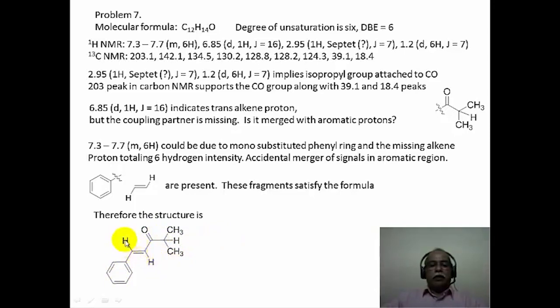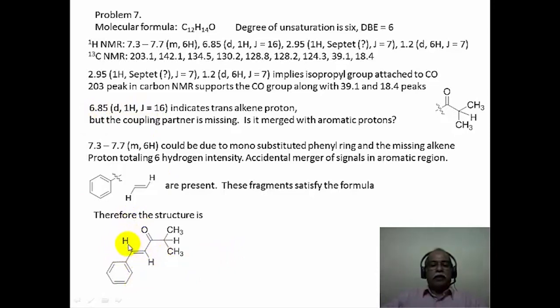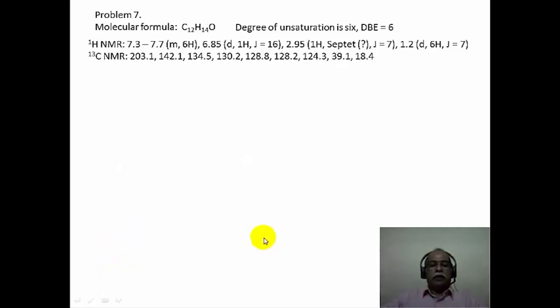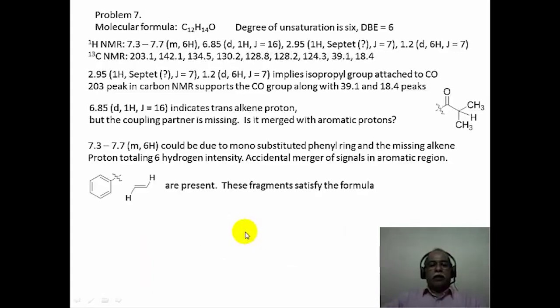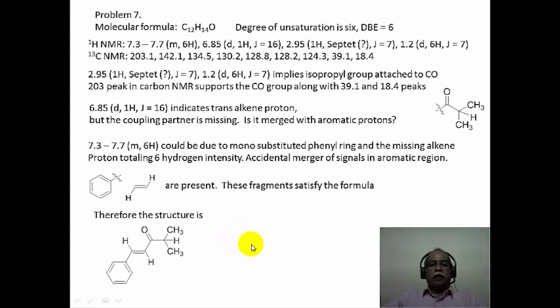Putting all these fragments together, you can arrive at the structure: isopropyl phenyl ethenyl ketone. The trans double bond corresponds to the 16 Hz coupling, and the hydrogen at 6.85 ppm corresponds to the alpha hydrogen of the alpha-beta unsaturated ketone. The beta hydrogen has a higher chemical shift value and merges with the aromatic signal. This NMR pattern essentially implies this particular structure is the correct structure for the data.